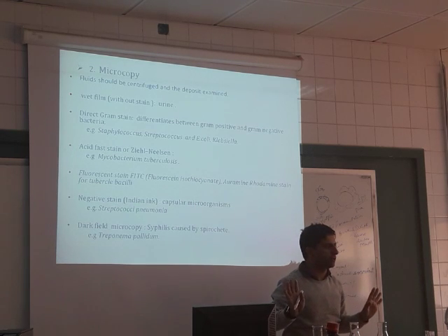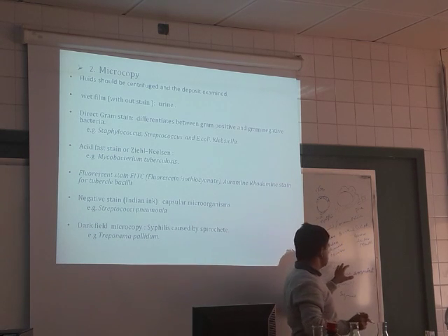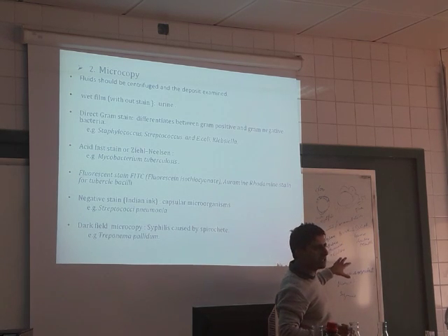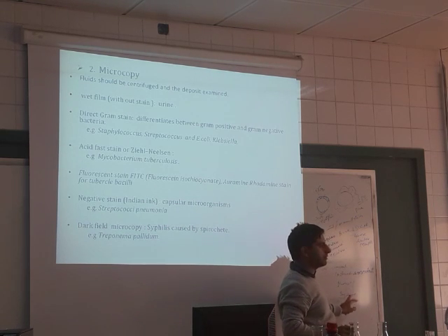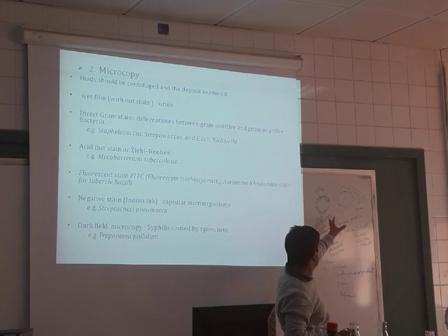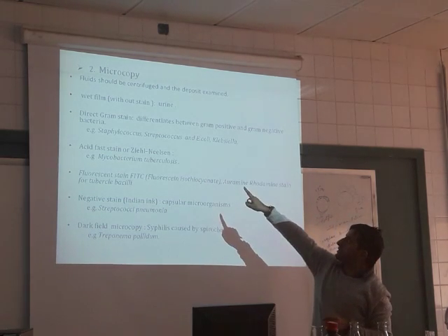This is the gram staining. Remember, do not forget this. The name of the scientist, the academician, was Gram. He applied these steps to differentiate between gram positive and gram negative bacteria. So this is the gram stain.